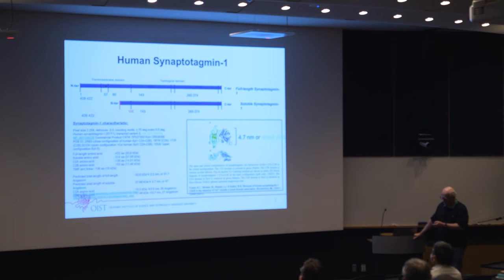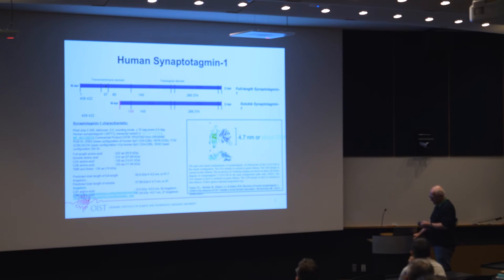So here's an example of how big it is. The two parts in it are such that the smaller protein is just 15 kilodalton, and the other one is 17 and a half kilodalton. So altogether, not a very large molecule. And at least as of this date, I don't think there have been any attempts with cryo-EM and single particle on this, for the reason of the size, of course. The molecule is also rather small. You can see 47 angstrom roughly in size.